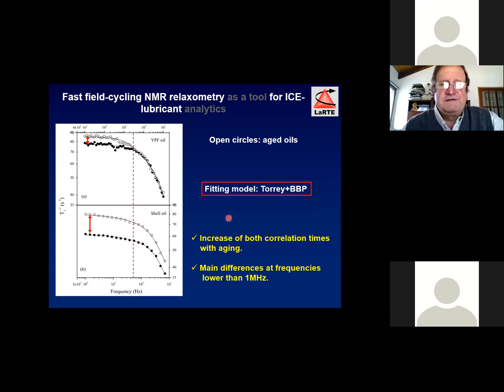Concerning the fitting model, this is not the essential topic of this talk, but I want to stress that such a simple model, a Torrey term for the account of the diffusion of the molecules, plus a BPP term, let's say a Lorentzian term for the account of molecular rotations, was enough to explain the dispersion, okay? So this is the essential point here, sensitivity.